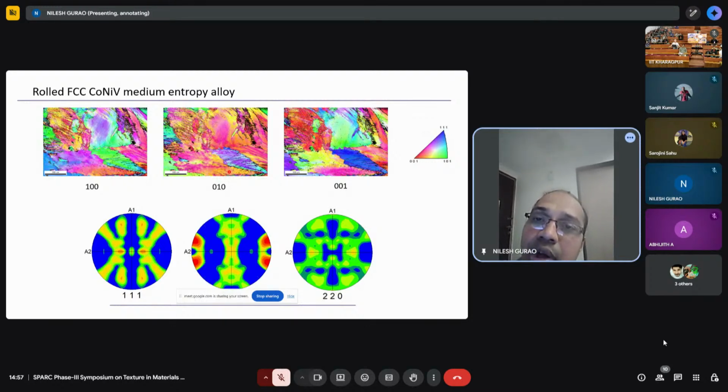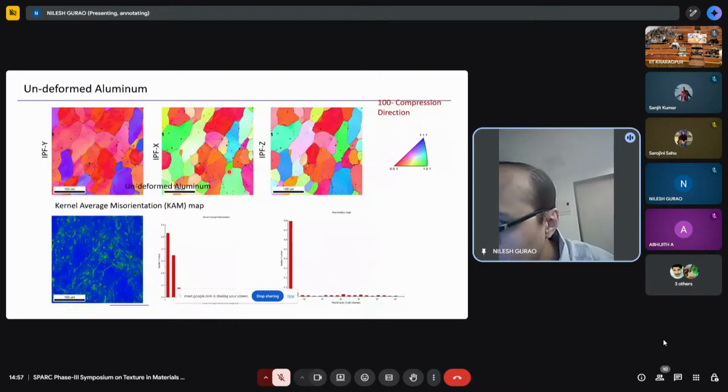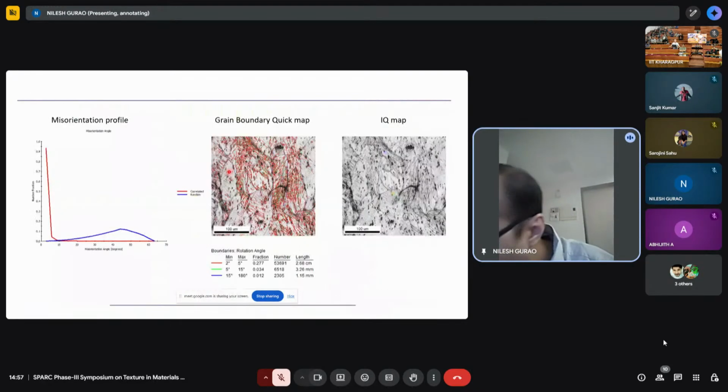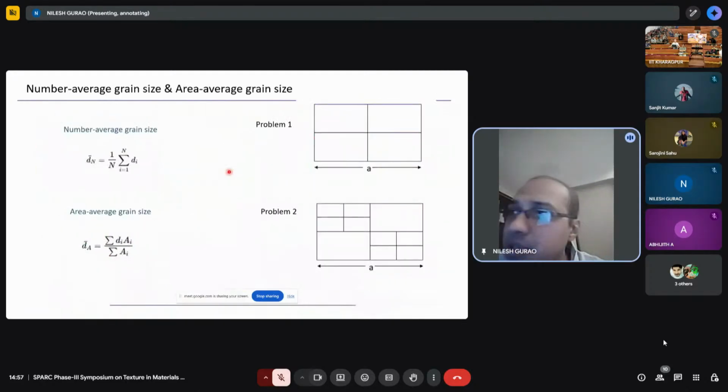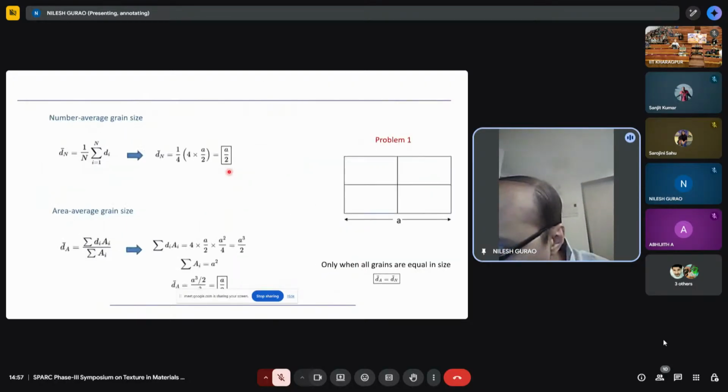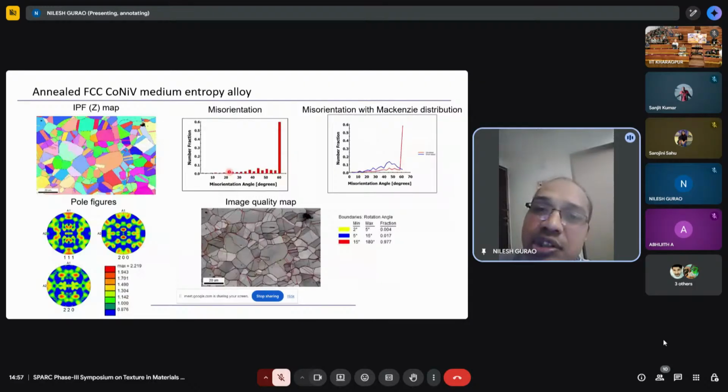So grain size will come. So what we will do is, let us try to determine the grain size. So I am giving you what has happened. I noticed that this thing got stretched. Let me go backward. So let's assume this is not looking like a square because the slides got stretched. But if I give you a square, so let me move ahead. I don't want to cover this. Let us consider a square.